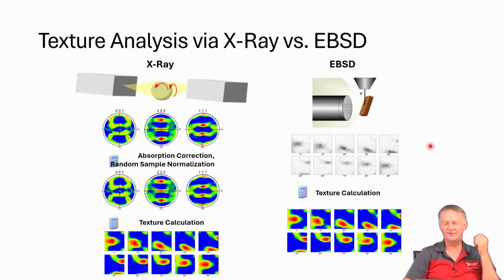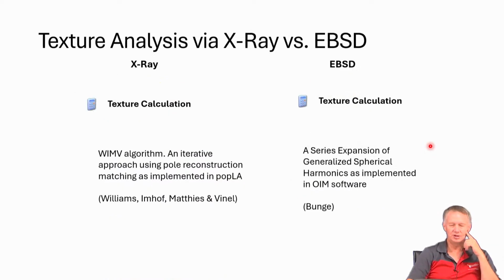In general, if I have a lot of data, then very small bins make sense, other than the fact that it will take longer in calculation time. But for EBSD, the calculation's pretty quick, so it's not that big of an issue. But let's go through some of the things, and we can discuss it when we get to that part of the slides.